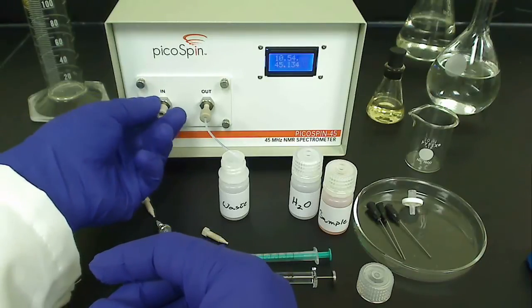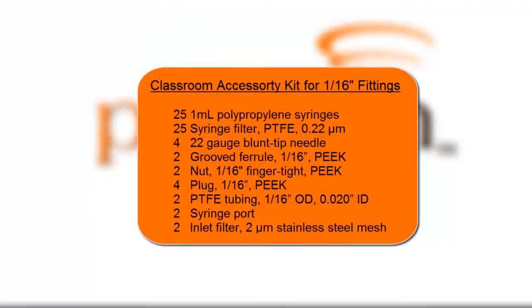Now, let's assemble our injection system from parts found in the Classroom Accessory Kit. The parts I'm using are a disposable 1 milliliter polypropylene slip tip syringe, a disposable inch and a half long blunt tip 22 gauge needle, and a syringe port.